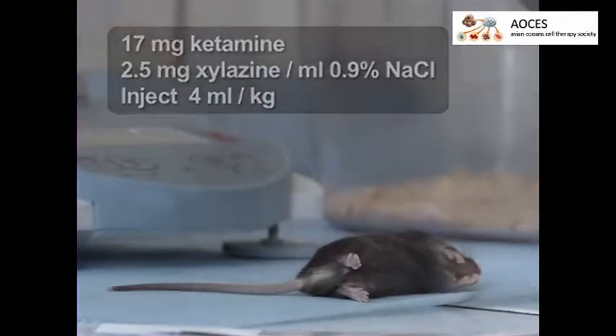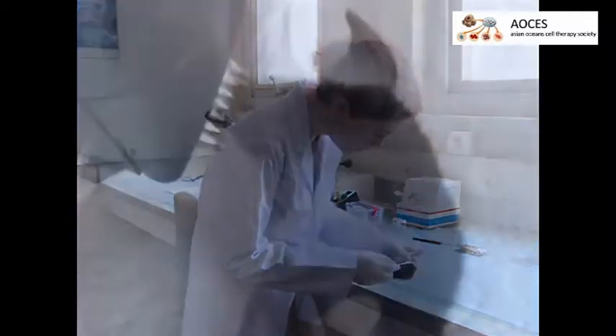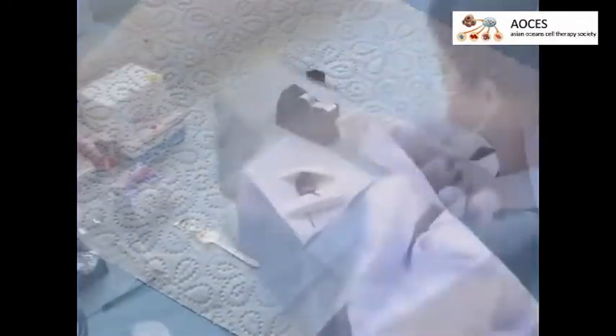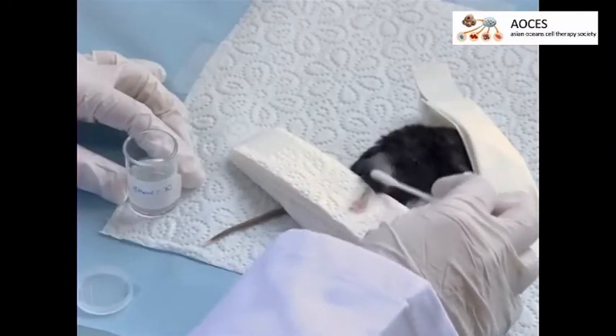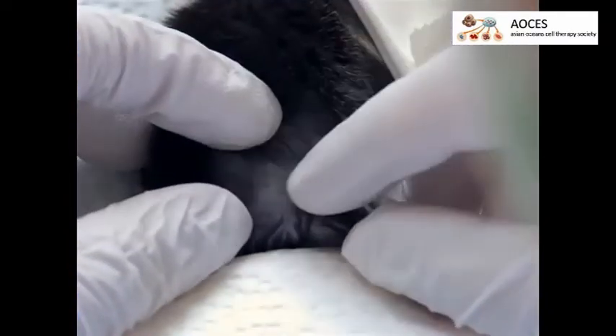Anesthetize the animal with ketamine and xylazine. Check for the absence of any paw or eye reflexes. Apply a protective gel to the eyes with a swab, then shave the right leg from knee to hip. Position the animal with the right hind leg up on a small pillow and secure this leg with tape.